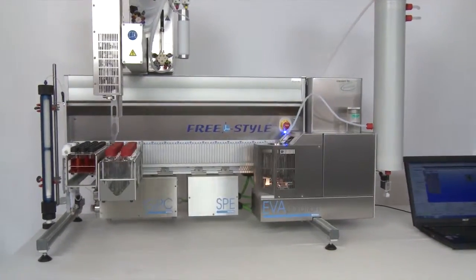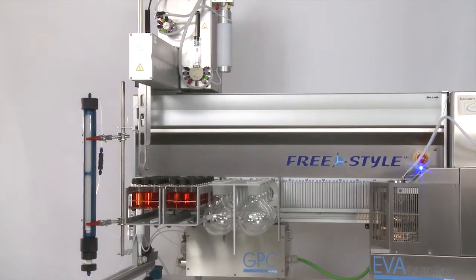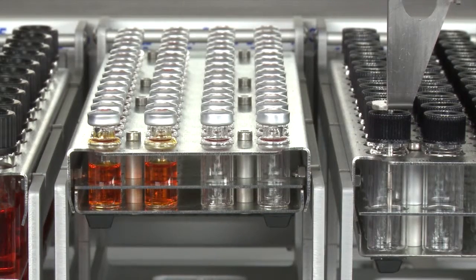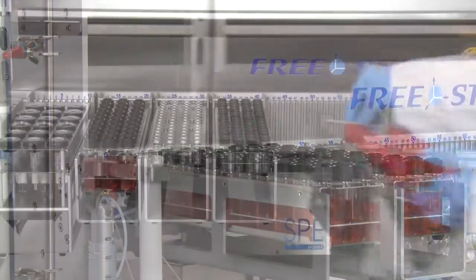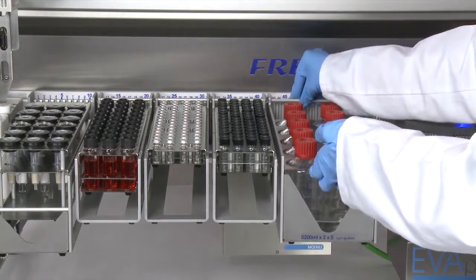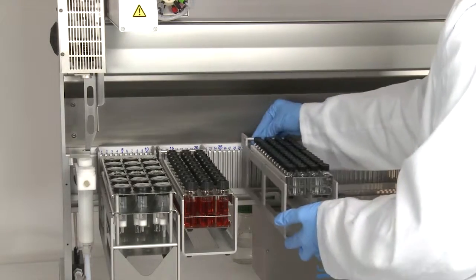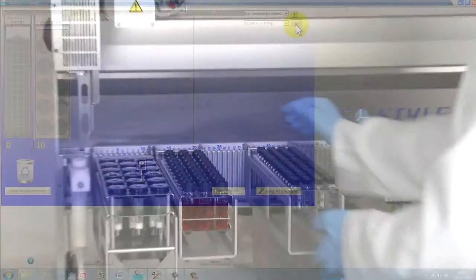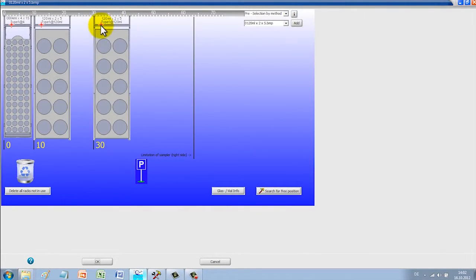Some competitors advertise 50 or more platforms. Freestyle has got only one on which you can freely combine all racks available. The racks are fitted in no time and are logged into the software with only a few mouse clicks.